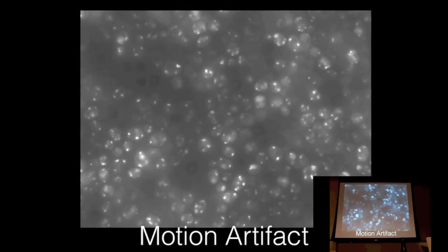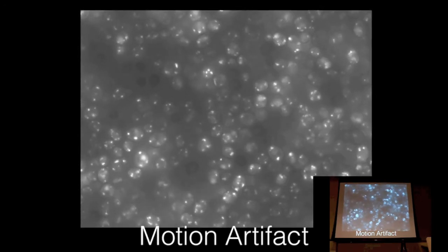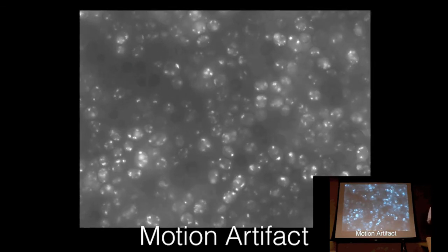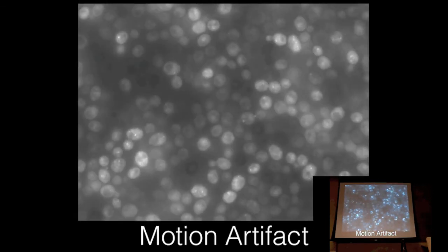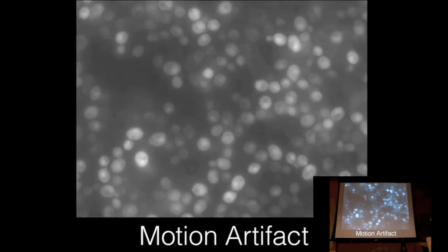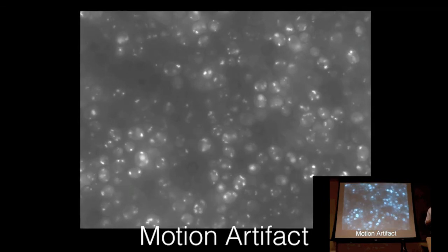So maybe you could try to heat the chamber. Well, the other thing you can do is use these real-time autofocus systems. It's more expensive. We have that on there, it's a definite focus system. So the definite focus is engaged on that. So that's the biology then of it being hazy.